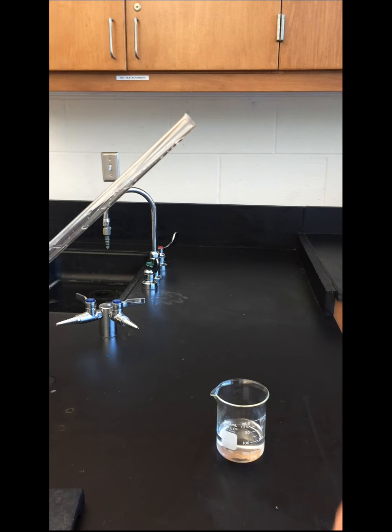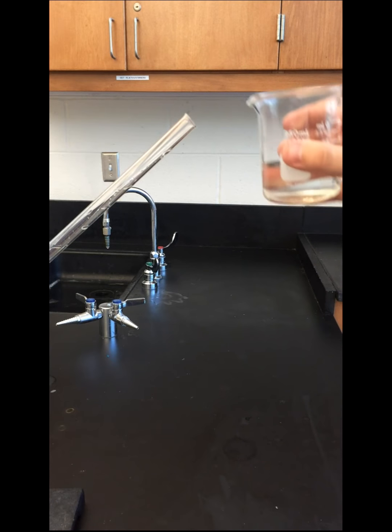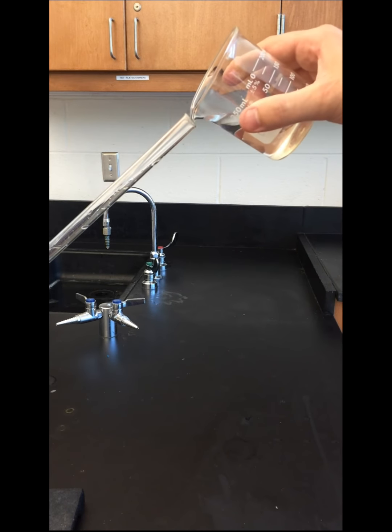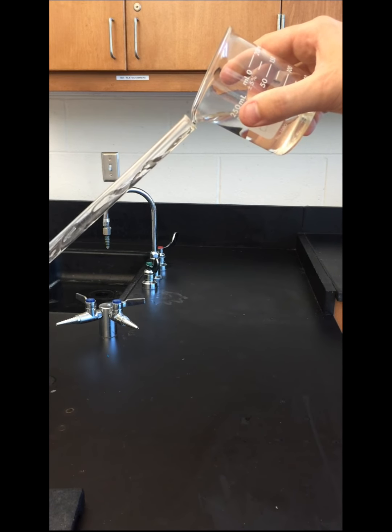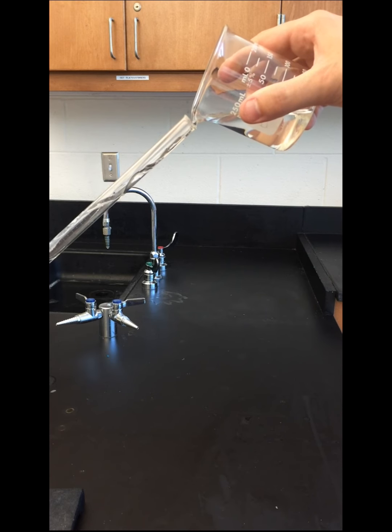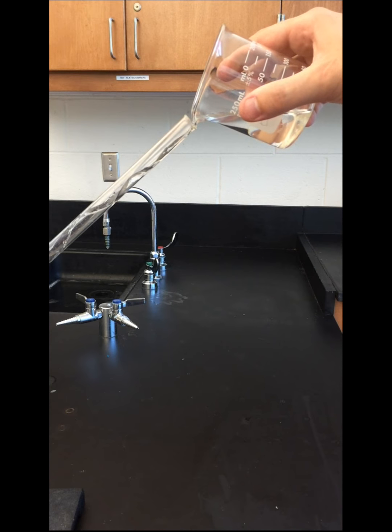After all the acid is added, we'll take distilled water and gently pour it down so that the distilled water forms a layer on top of the hydrochloric acid, which remains sitting at the bottom. We don't want too much mixing to occur during this process. The eudiometer should be filled all the way to the top.